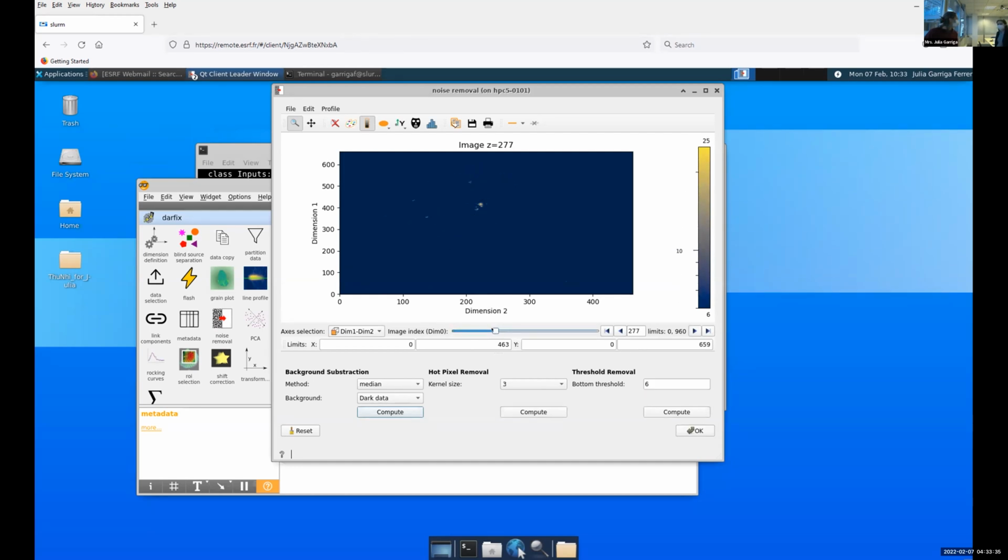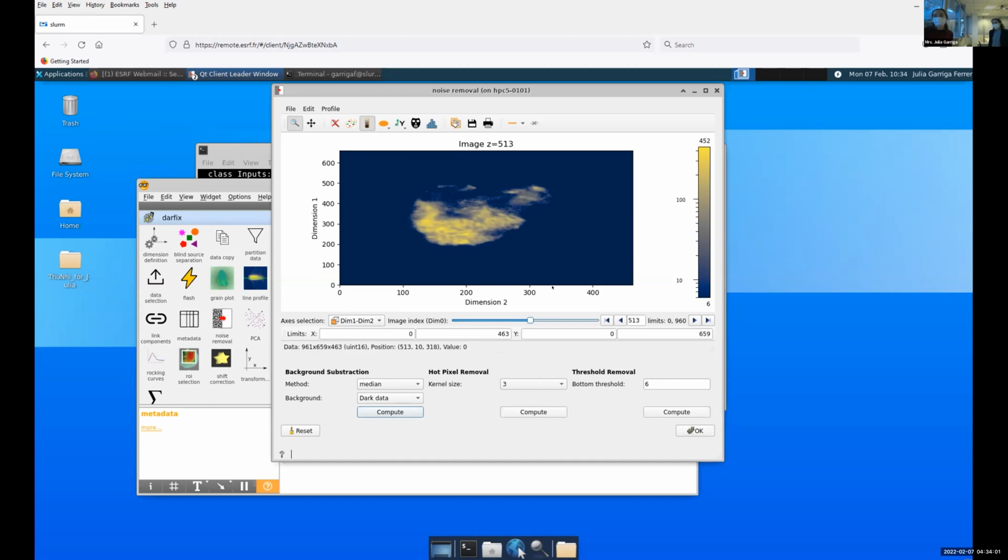Do you want to show something like the presentation? No, it was only for the grain that, even after applying all this, we will still have some clusters of information around that might or might not be from other grains and from real things, or they may only be pixels. We will only see that once we have finished all the data treatment, because even if we do the zoom, in this case, they won't show. They are so low in intensity that they won't show. Yeah, okay. They actually show in the mosaicity map. Yes, the red block. We'll see that later.